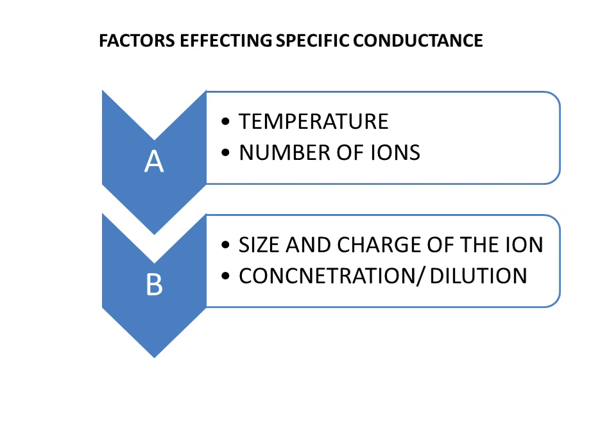So your classroom, the volume is fixed. How many ions are there? Say for example 30 ions are there, and all these ions will move and make some noise. That's what we exactly call specific conductance. What are the units of specific conductance? Siemens per centimeter.